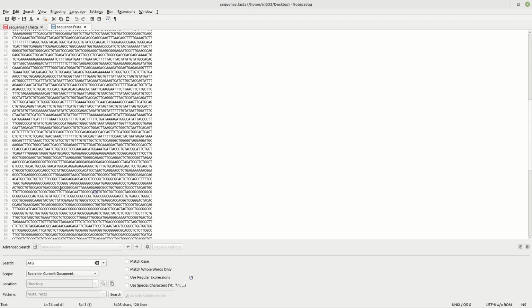Start is green, I like that. Change it to green, how about that? Something like that. But somehow tell me that you think that's the start codon, so I'm giving this one to you. In other words, I am telling you that that's the start codon, and so you should all get that one right.